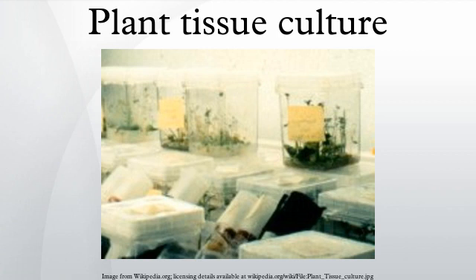Some explants, like the root tip, are hard to isolate and are contaminated with soil microflora that become problematic during the tissue culture process. Certain soil microflora can form tight associations with the root systems, or even grow within the root. Soil particles bound to roots are difficult to remove without injury to the roots, that then allows microbial attack. These associated microflora will generally overgrow the tissue culture medium before there is significant growth of plant tissue.